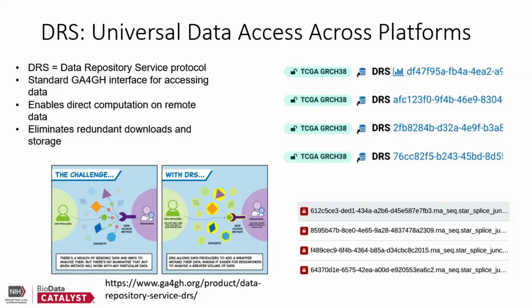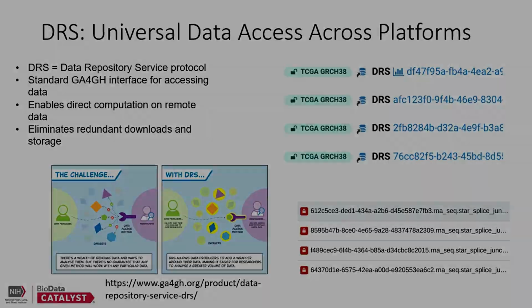entire files. When you import data this way, you're actually importing DRS URIs, unique identifiers that point to the data. The platform then fetches only the data you need for your specific analysis as you need it. When you see a file imported via DRS in your project, you'll notice a special indicator showing it's an external reference. You can use these files in your workflows just like any other file, but they don't cost anything for storage. This makes your analysis both faster and more efficient, particularly valuable when working with large genomic datasets.